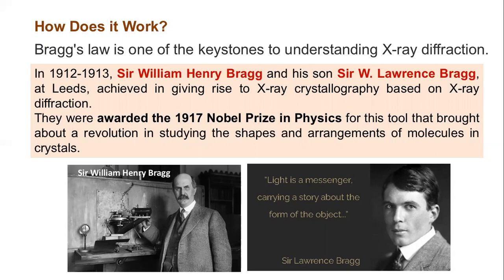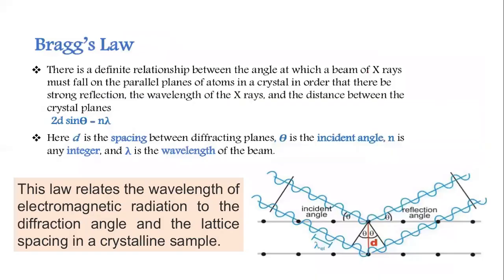It has turned out to be one of the major techniques in material characterization, which gives us information about the crystalline as well as the amorphous nature at the atomic level.